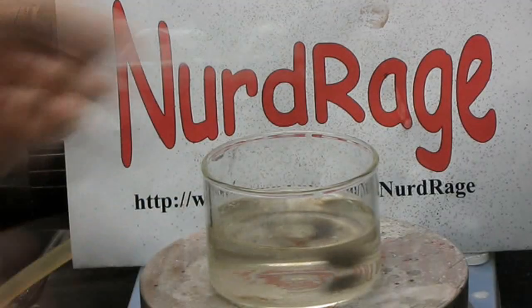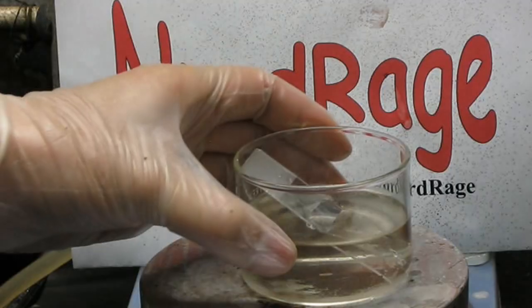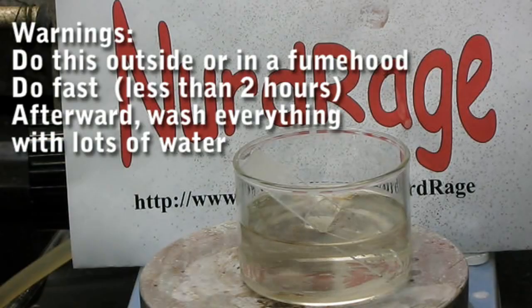Now we place it into the silvering solution and turn on the heat. The solution needs to be hot, but do not boil it. Since the heating will cause the solution to release ammonia, you need to do this experiment outside or in a very well ventilated area.